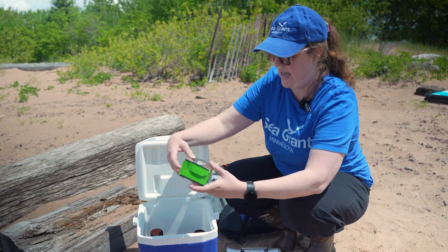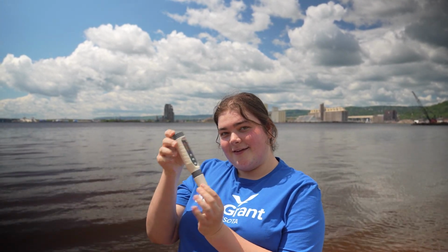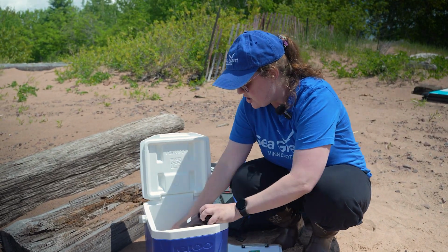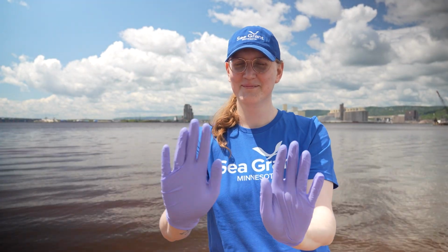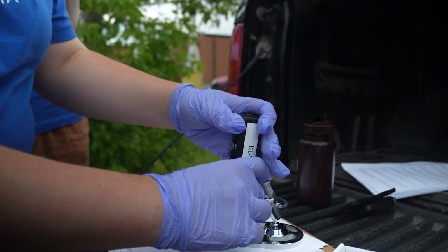You will also find a pen style water quality meter. This is what you can use to both look at surface chloride levels and then also to take a surface water temperature reading, and you'll record that in Fahrenheit. You will also find some pairs of the gloves that Chris mentioned. So if you do observe a bloom, make sure that you put these on before you start to collect your water sample.